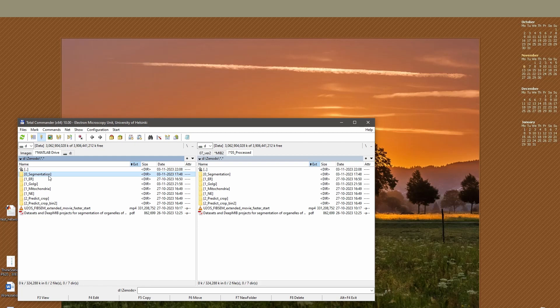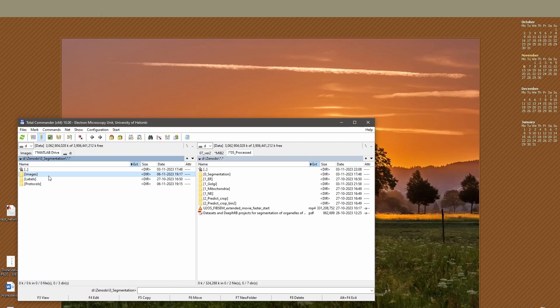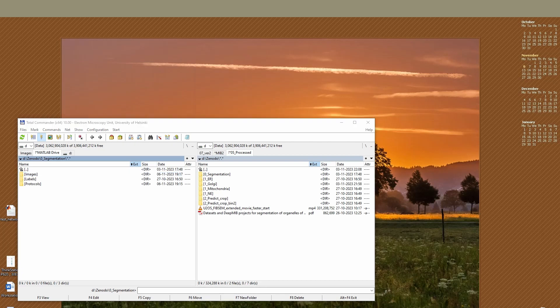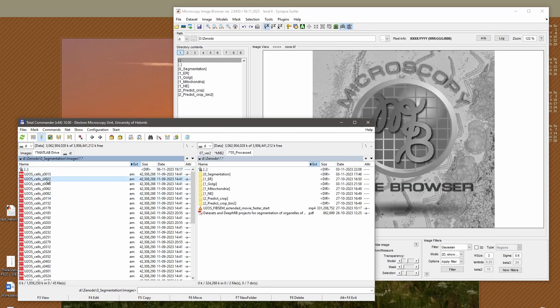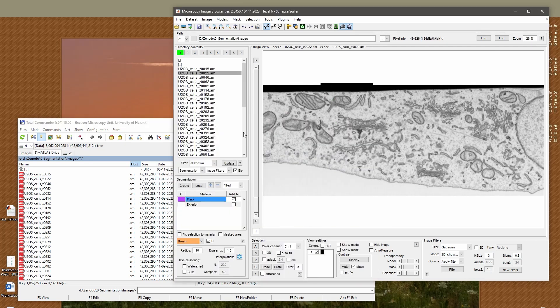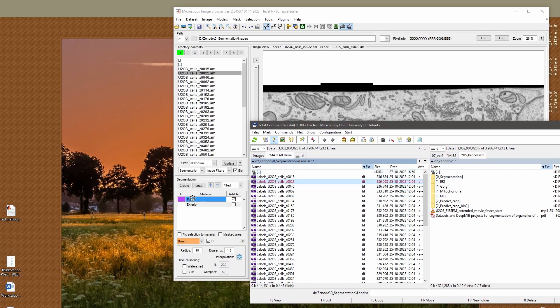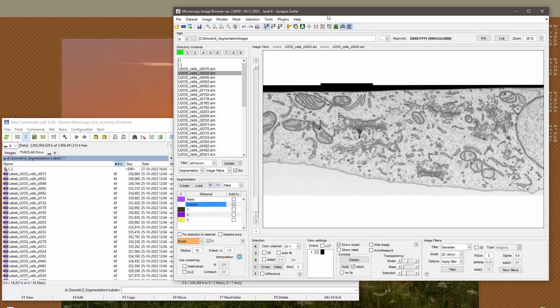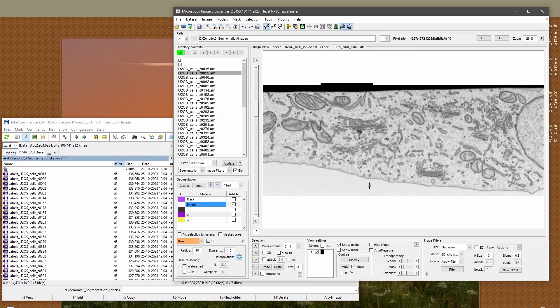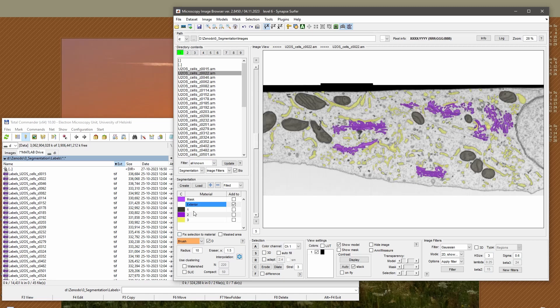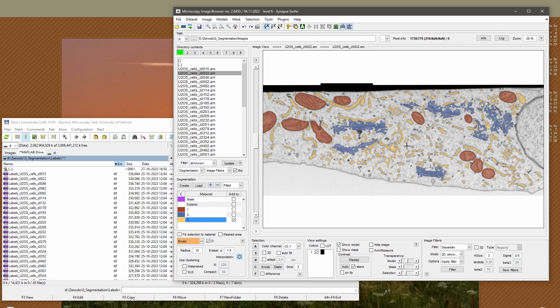In the directory called 'zero segmentation' you can find three subfolders — these are the ground truth models that we used for training the convolutional neural networks. I can drag and drop an image into the image view panel of Microscopy Image Browser, and then drag and drop the labels file to the segmentation table. What we have now is a small sub-volume of nine slices where only the middle slice is segmented. The red color shows segmented mitochondria, blue color is Golgi, and yellow is endoplasmic reticulum — so these three organelles are in this training set.